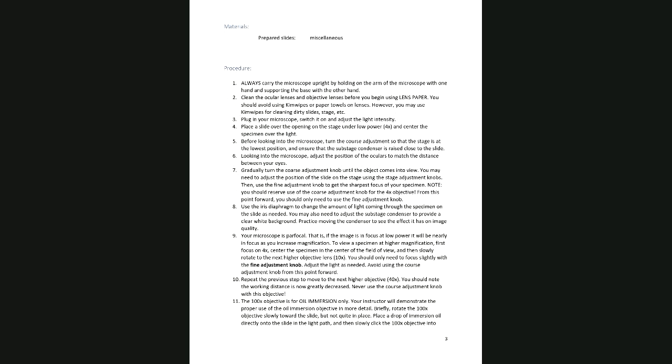So when you carry a microscope, you're supposed to use two hands because these things are heavy. So no one-handed carrying of the microscopes, unless you happen to have $2,000 to spare to replace it when you break it. Always clean your lenses before you get started. That's very important because the student in the class before you may have been in a hurry to get out and may not have done a good job cleaning. So you always clean your lenses before you start, and always clean your lenses when you finish. So make sure they're clean. Always reset to the lowest power lens for the next student to get started.